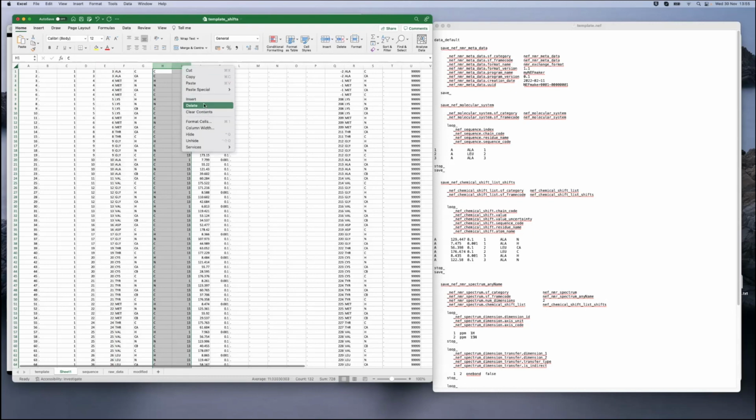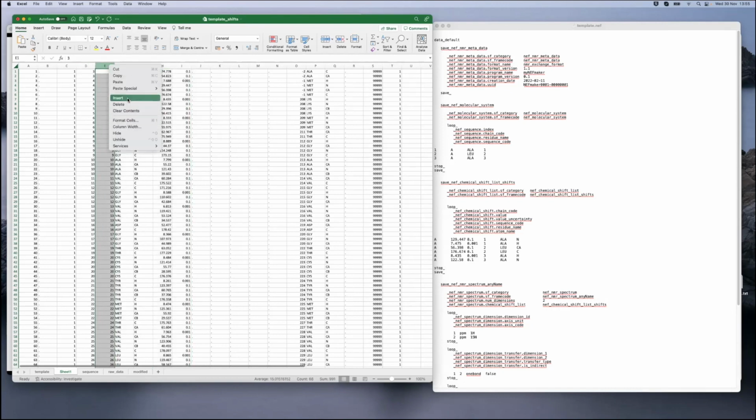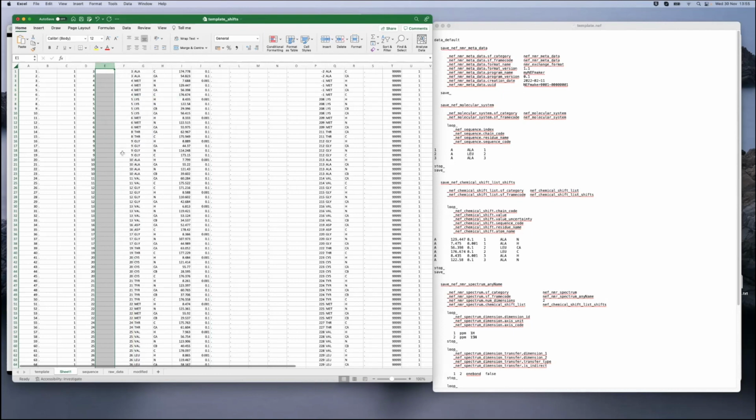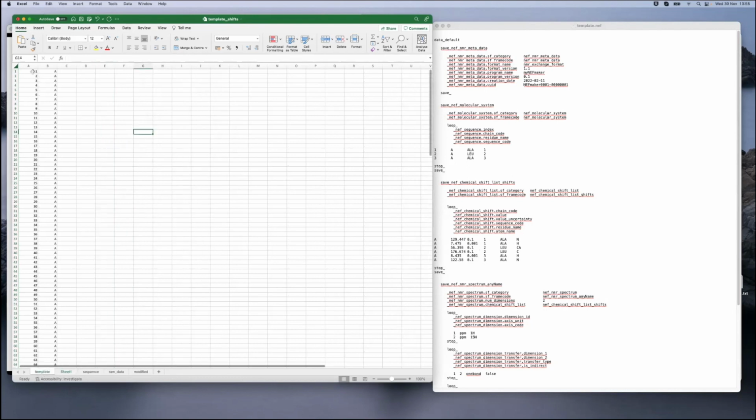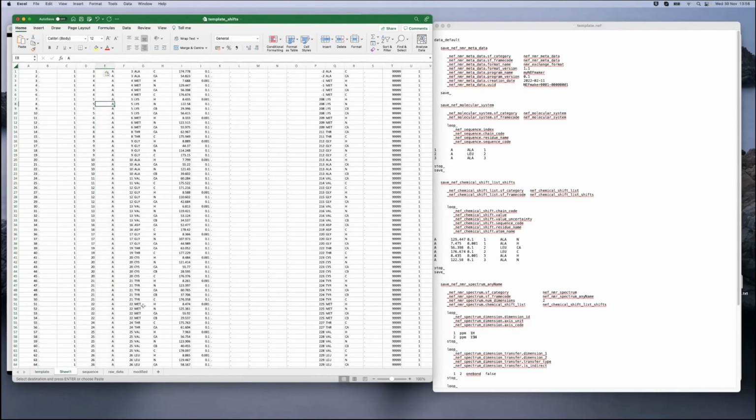Excuse me, you can just remove them and just add an extra column to incorporate the chain code for our data into our NEF file. Because I've done it a fair number of times, I have my column prepared, and I can just paste it for this data set.